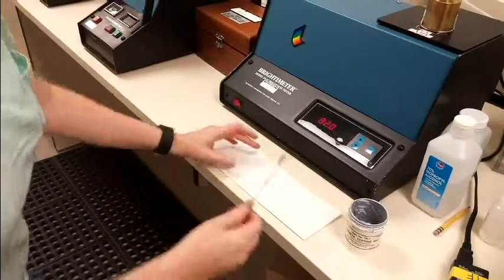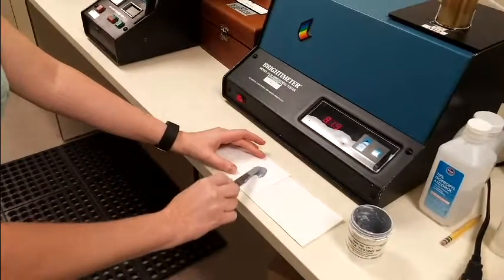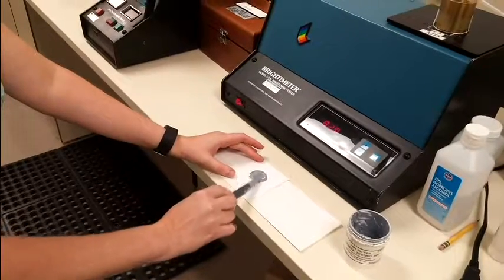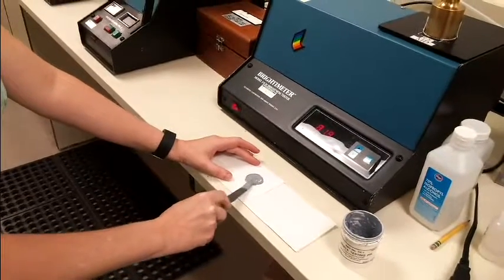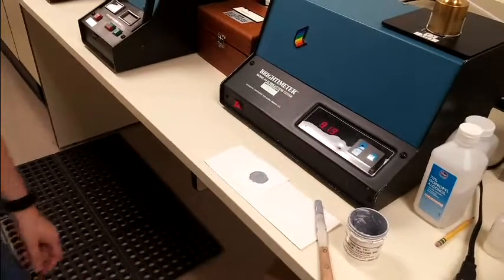Ink is applied to the surface and is left in contact for a measured length of time. The ink is then wiped from the surface and the brightness drop measured. A surface that is more receptive to ink will show a larger loss in brightness.